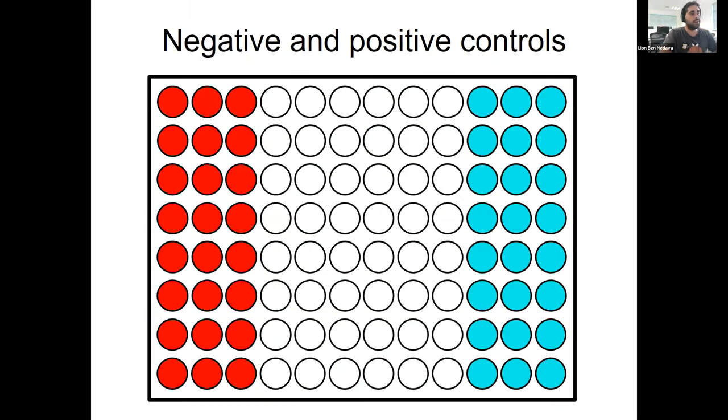Yeah. We usually expect the artifact to be on the entire batch or in some of the wells. I showed you several examples. Uneven illumination, you're going to have an effect on some regions, right? There are effects that are general for the whole plate, for the whole experiment, and there are some that are specific to specific locations. I agree that if you want to be more systematic, this is just for the presentation, usually you don't do it this way. You put your controls randomly, right, to capture the whole space, so that if something is wrong, you'll be able to identify it. Okay.